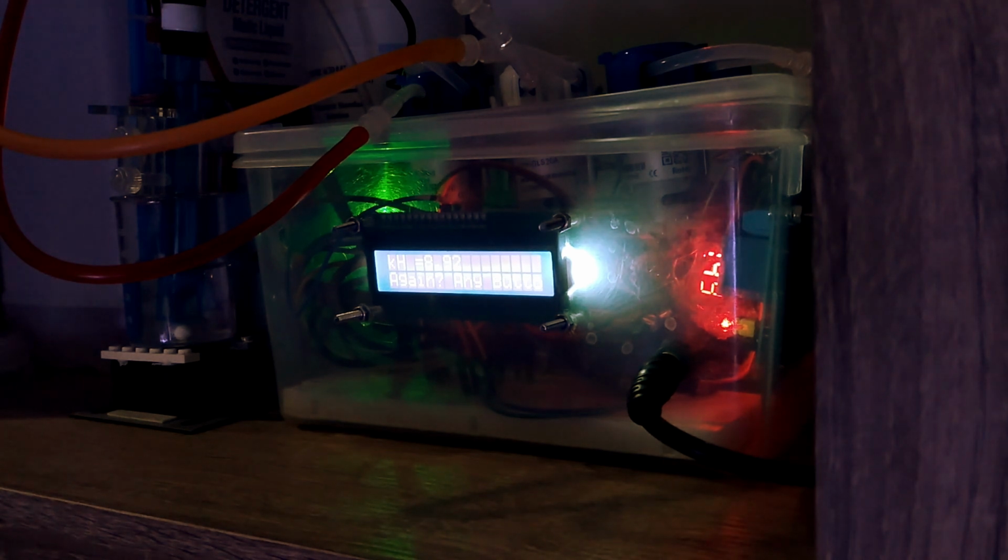The program basically stops, and I set the program so it doesn't throw away the liquid directly, because I want to have the probe submerged in the water when I don't use it. I don't want it to dry. So the next time I want to do alkalinity measurement again, the equipment will take out the water and do flushing again and do the next procedure of alkalinity measurement.